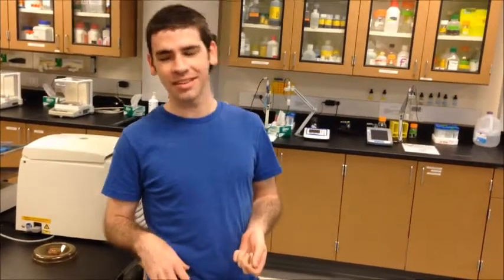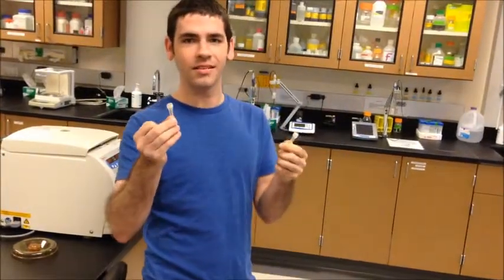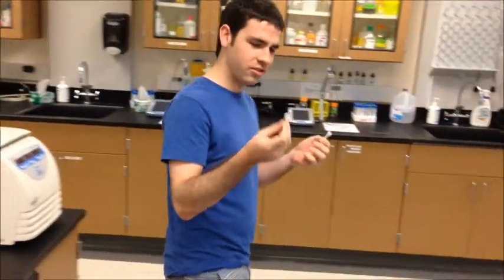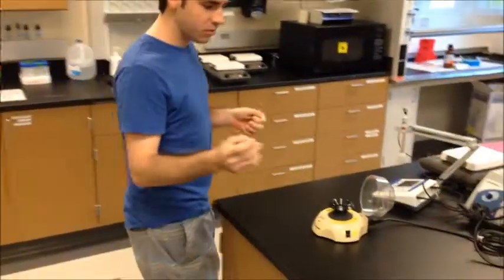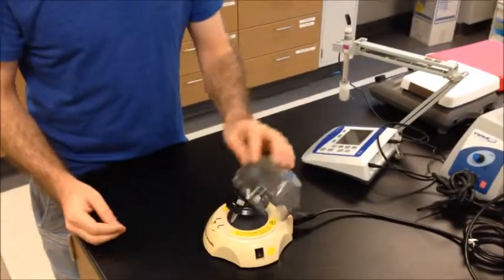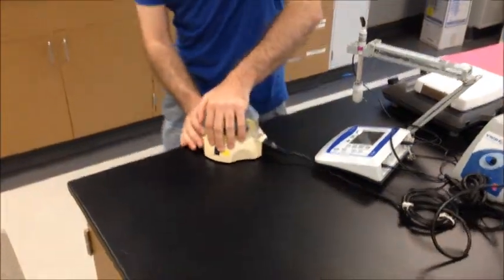So in a science environment, we wouldn't be spinning people, we'd be spinning cells, isolating the different components of the cells. So say I've got the whole cells, I've got DNA and I've got protein that I want to separate. I would just take them using this little one, for example. I would just throw them in there and let it go. Oh, what's happening, what's happening?